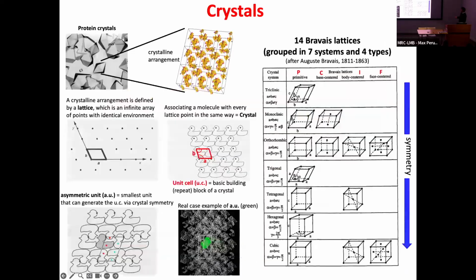I will help you. Just a little briefly about crystals. So crystals, the arrangement of the molecules, which is all in the same direction inside the crystals, is defined by a lattice.